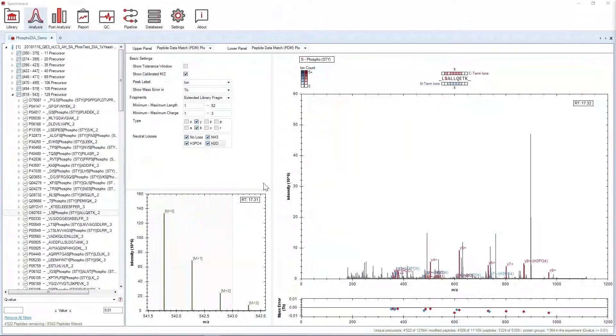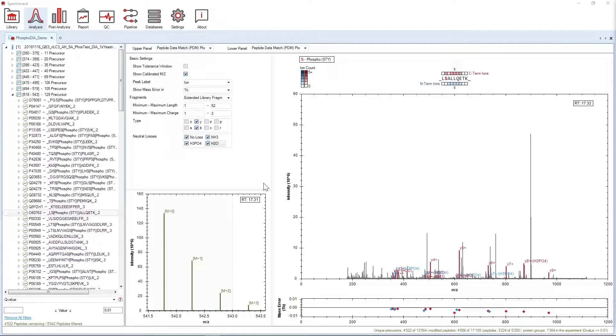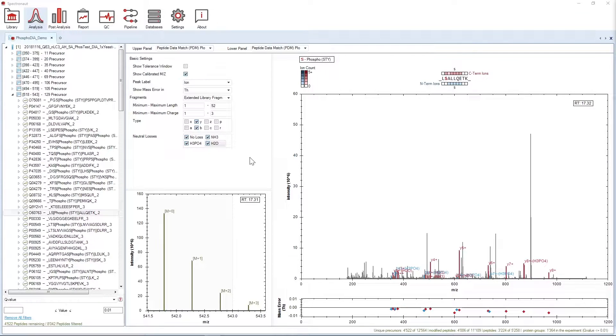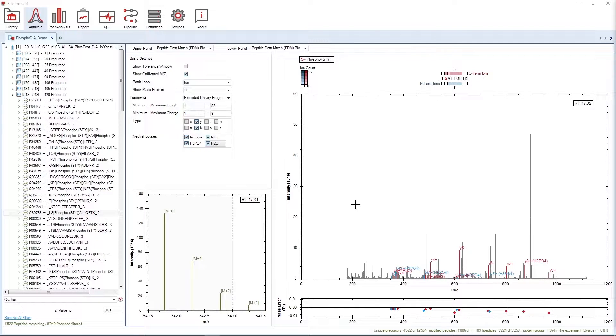First, let's look at this plot. The plot can be found in the analysis perspective of Spectronaut at the level of the precursor. There are three frames. In the upper left frame of the PDM plot, you can set some preferences to be displayed in your plots. The bottom left frame shows MS1 information, and the frame on the right shows MS2 information.